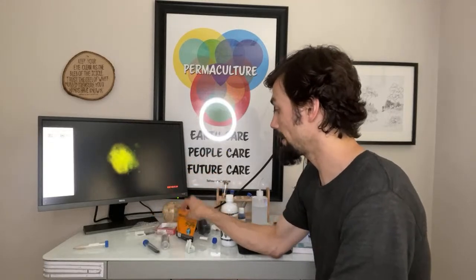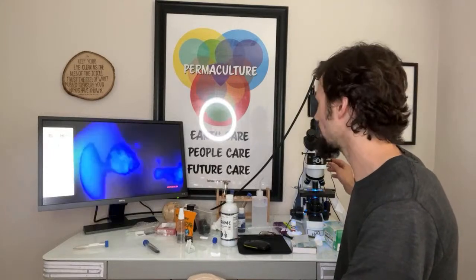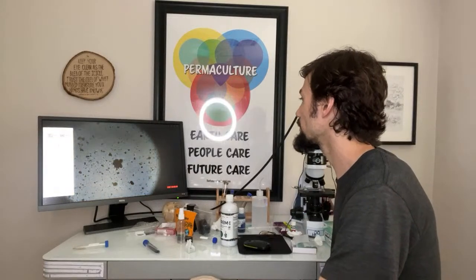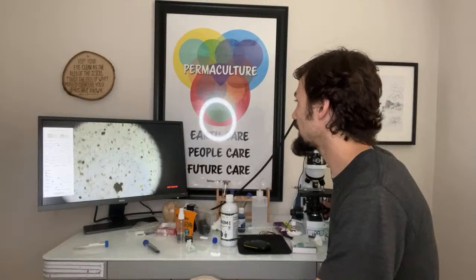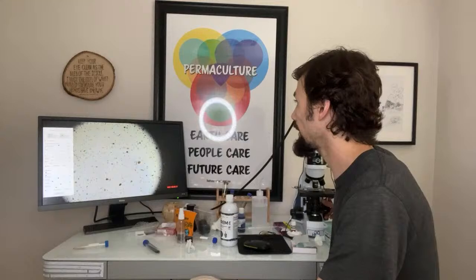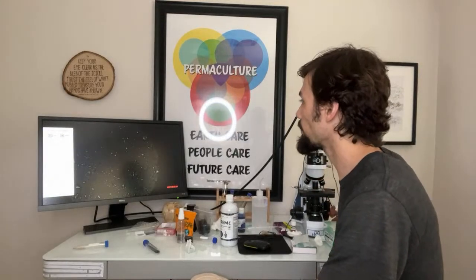But it's, I mean, it's gonna be clay or sand. So let's dive back out and navigate around. I'm gonna turn up the light. So yeah, same sand and clay silicates everywhere and aggregates. Let's zoom in and see if we can find some spores.